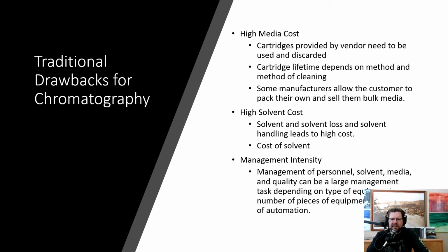The higher end phases that I was talking about, like $10,000 per kilo, those are the selective phases. So oftentimes they'll be like chiral stationary phases, or they'll be size exclusion phases, or things along those lines. If you're talking about just THC and CBD, you are talking about very low cost stationary phases on the order of, basically 500 to 1,000 or 500 to $2,000 a kilo. So depending on who you're dealing with.